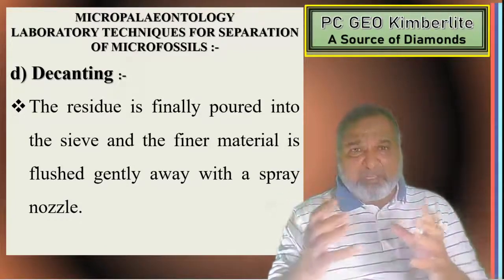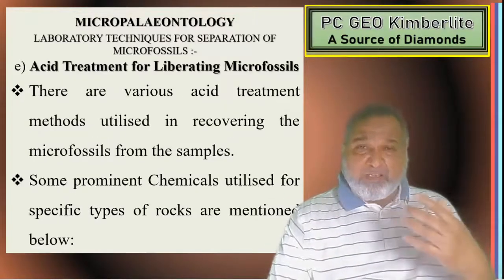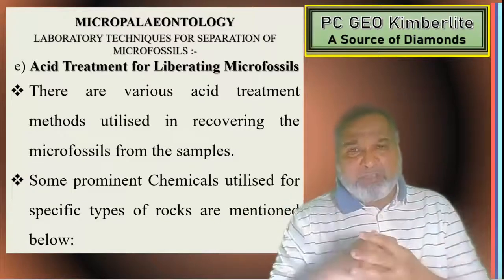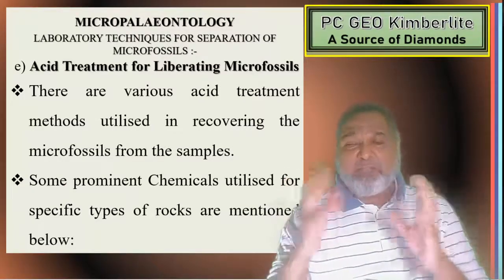The finer material is flushed gently away with the spray nozzles. Then, if it is separated, pick it up and keep it somewhere in the trays. Now, next one: acid treatment for liberating microfossils.